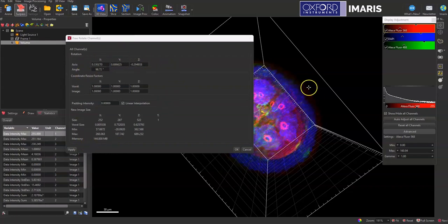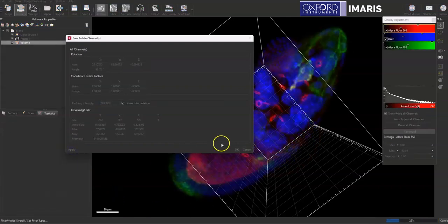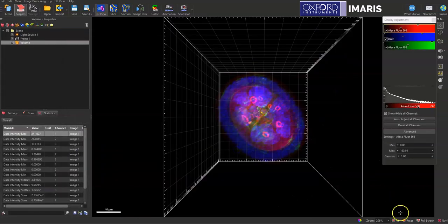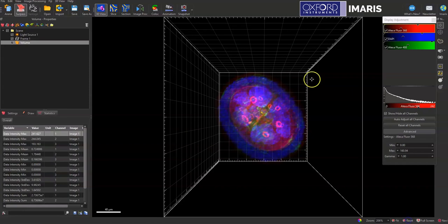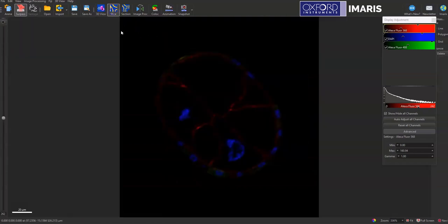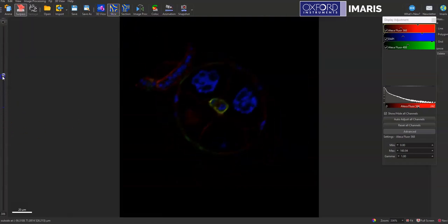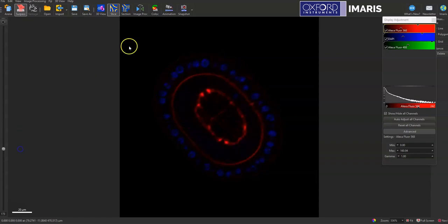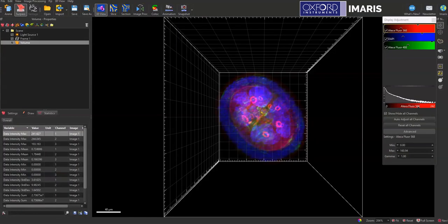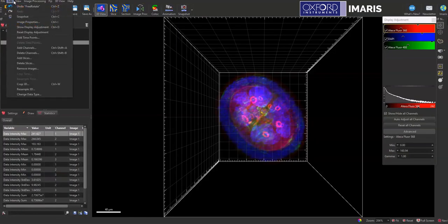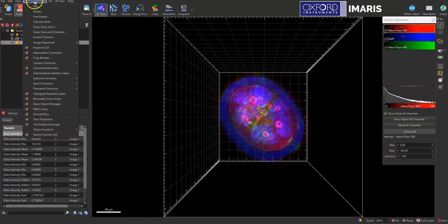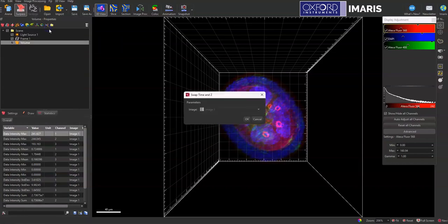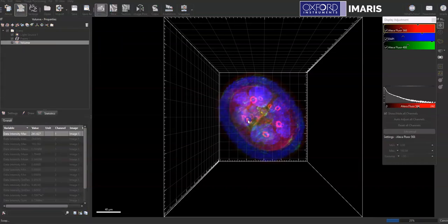Or you can just move the actual image itself and select apply, hit okay, and then you can see that I now have this as my different slices that are going through and can use that as the Z stack that I'm going to swap with the time.